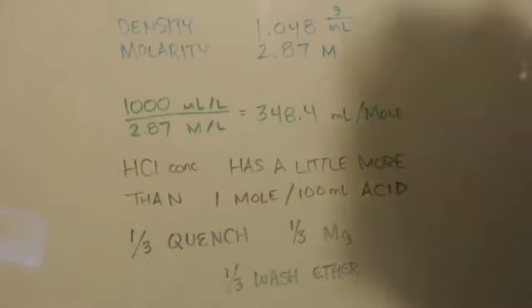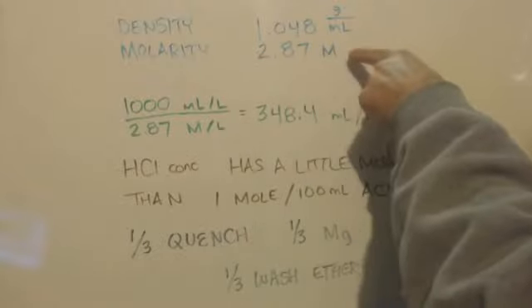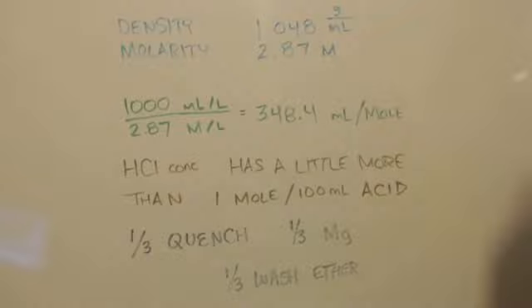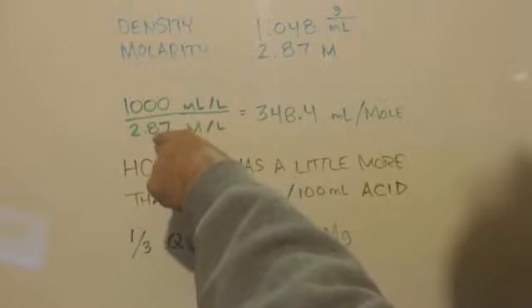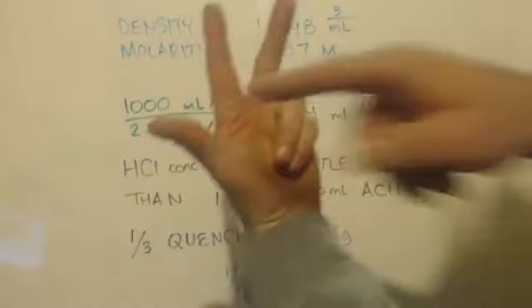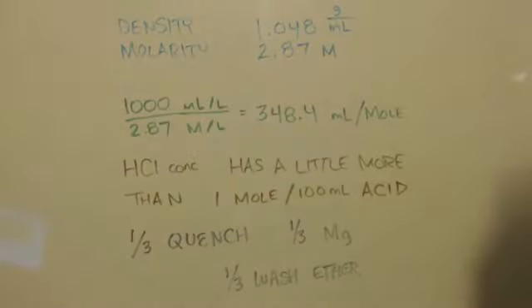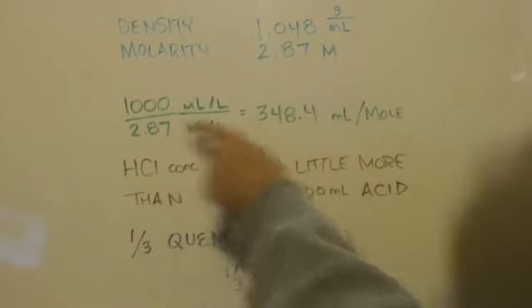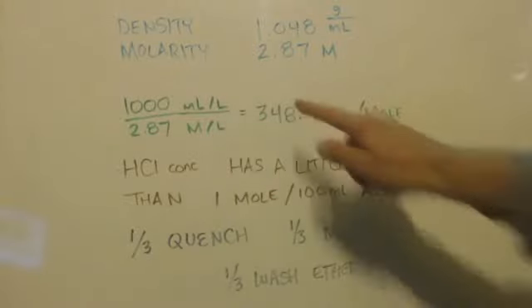Okay, the density and the molarity of hydrochloric acid. I got this from Wikipedia, and this is for a 10% solution. So what do I do? I take 1,000 milliliters, because this is per liter, right? There's 2.87 moles in 1 liter. There's 1,000 milliliters in a liter, so I divide it, right? Let's pretend this is 3, okay? So that means there's 3 moles in a whole liter. If I divide it by 3, that's 3 parts. And if there's 3 moles, that means each part has a mole, right? So I divide it by the 3, and I get 348 milliliters. That means if I take this times this, it'll equal that, right? Because 3 times that equals that. So this must have 1 mole in it, right?